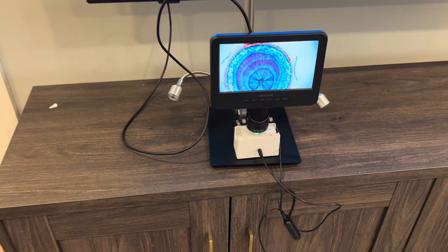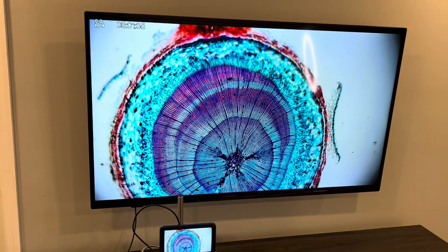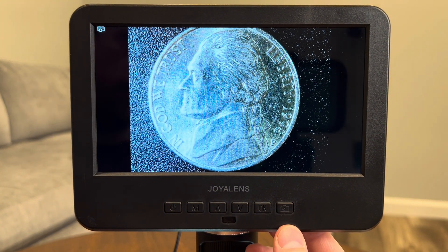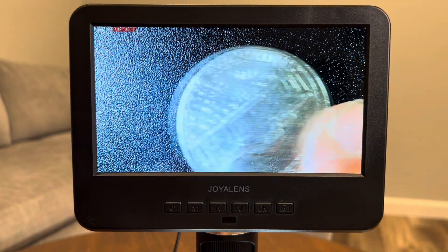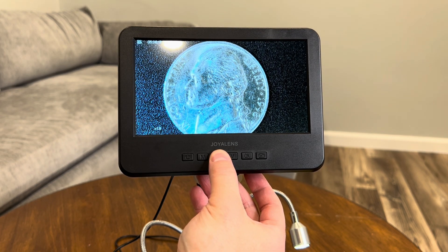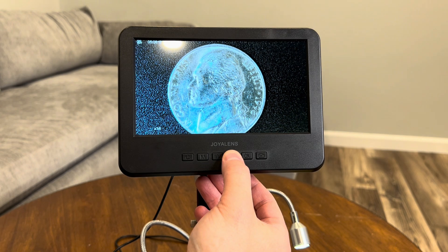One of the biggest pros is the microscope's ability to connect to a TV via HDMI cable, which is very useful for projecting images to a large audience. The next pro is the photo and video capture — the built-in camera lets you easily capture high-quality images and record videos directly from the microscope, which is convenient for documenting findings, sharing with colleagues, or keeping a record of your work. And a final pro is the easy setup and intuitive controls — setup is quick and painless, and whether you're adjusting the zoom, focusing, or switching between modes, everything is straightforward and easy to use even if you're new to digital microscopes.